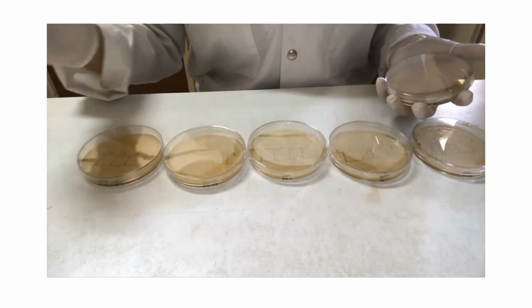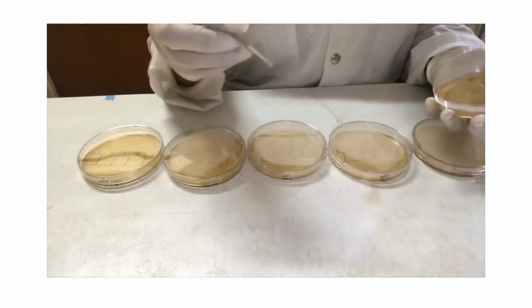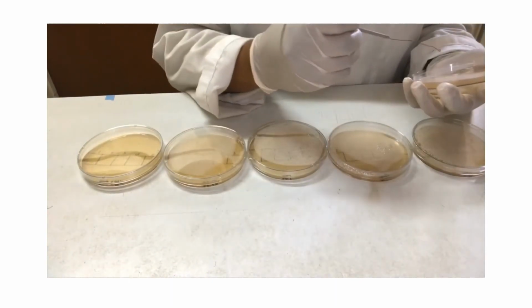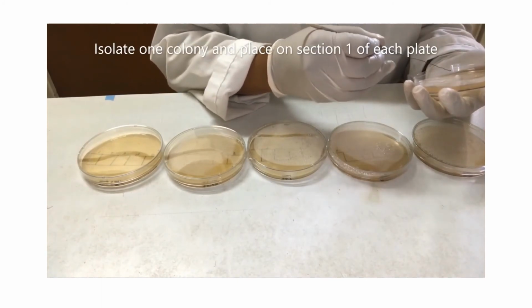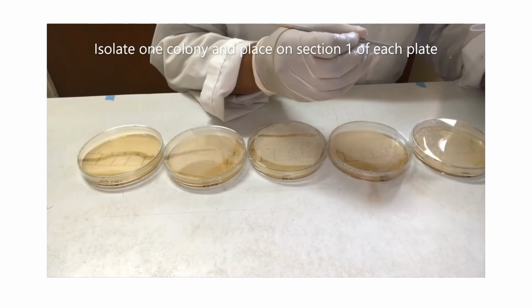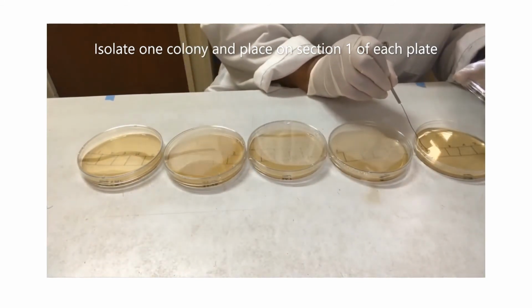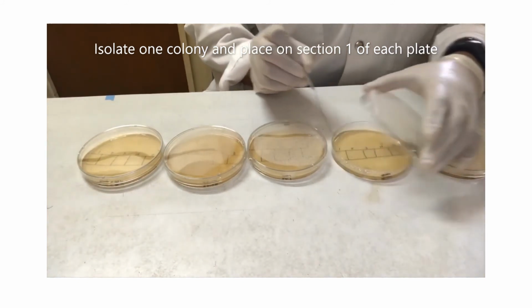A sterile loop is used to collect a single colony of bacteria from the mating plate. The isolated colony is then transferred to section 1 of each plate.